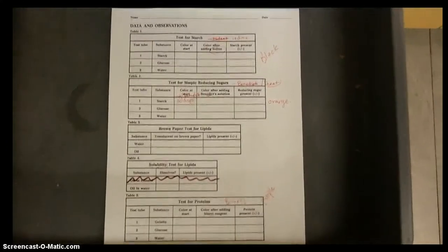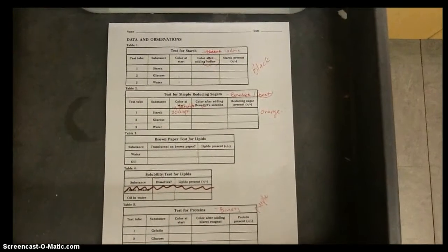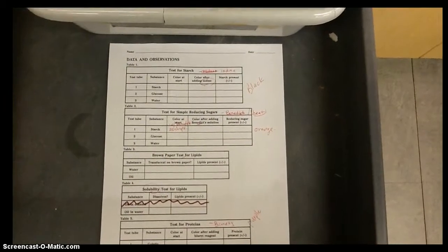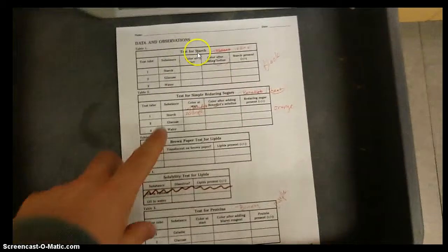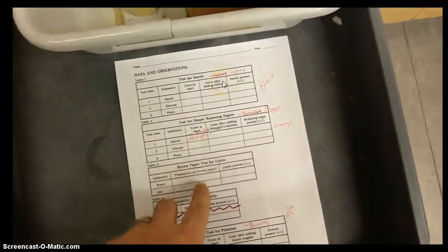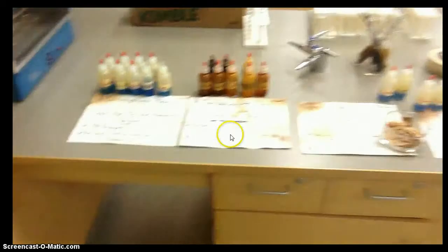All right, here is a quick little intro to your lab that you're going to be doing today. What this is going to entail is you going through and taking a look at your lab stations. You're going to be looking at doing a lab between starch, between sugars, lipids, and proteins.